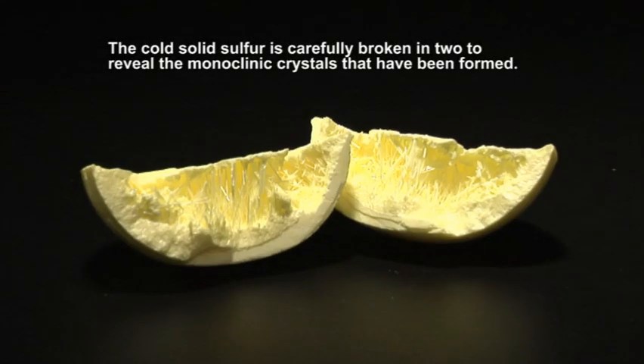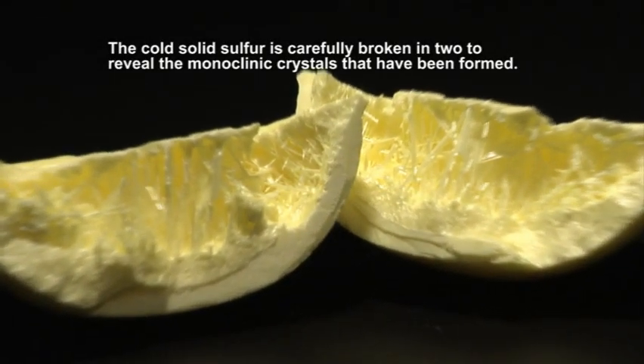When the cooled solid is broken open, the monoclinic crystals can clearly be seen.